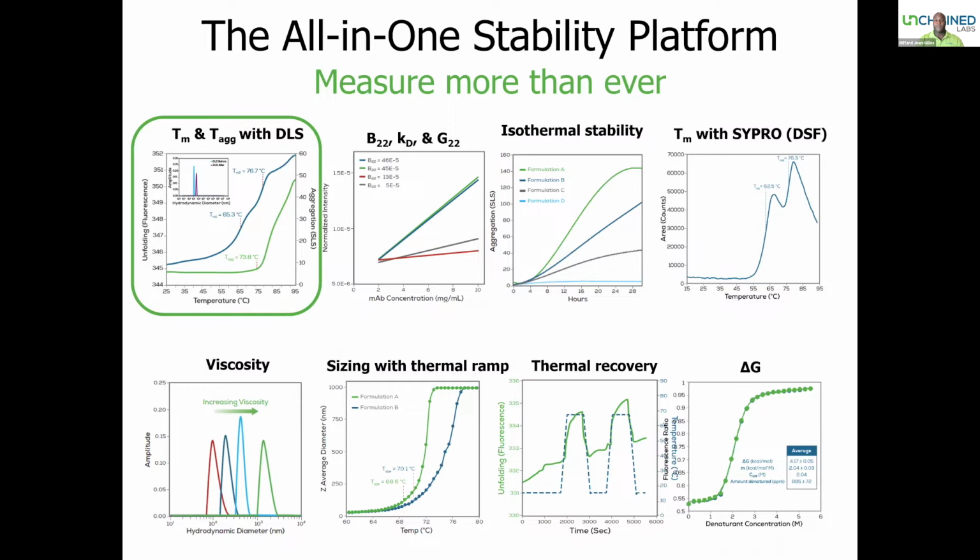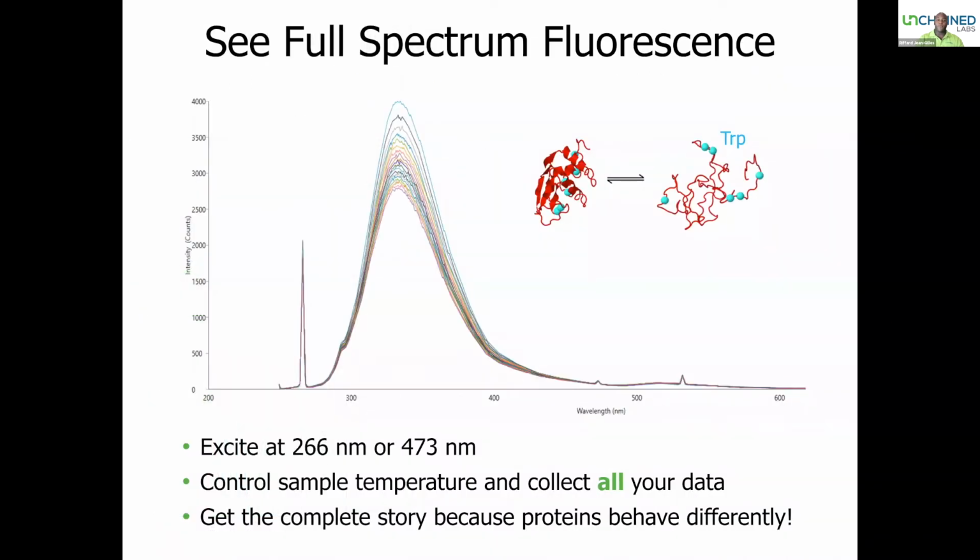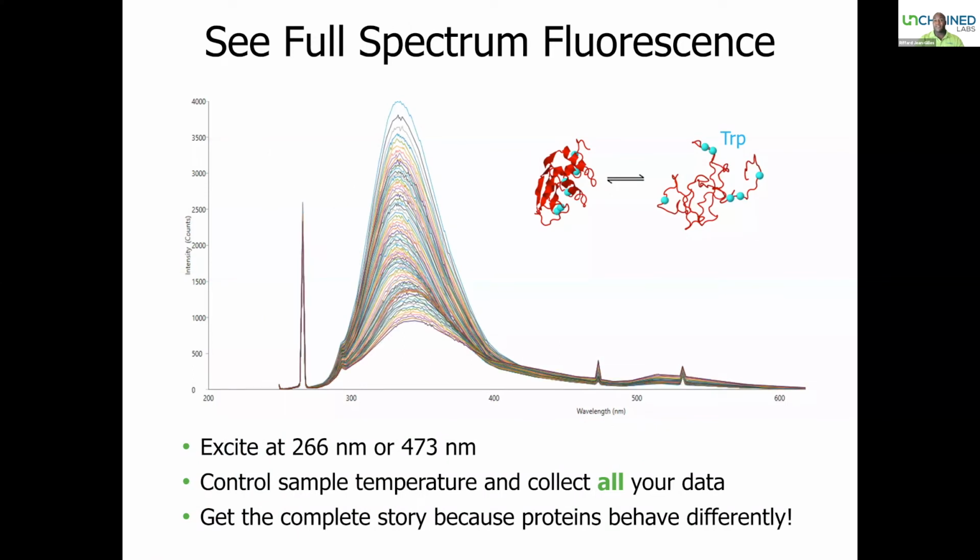But for the next few slides, I'm going to focus on the TM, Tagg with DLS, and we'll see exactly how that application can be really useful in allowing you to distinguish samples and do some construct screening. Okay. And so before we do so, I want to really give you a bit more insight into what we collect in the TM, Tagg experiment.